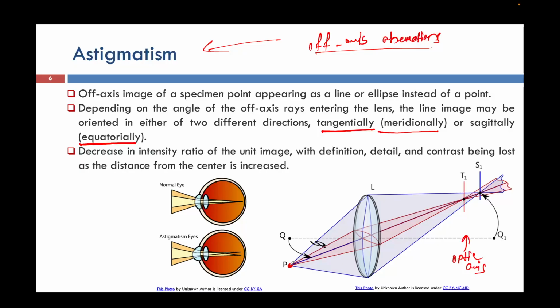Let's say you always cannot have a point. We are living in a three-dimensional world. So let's say if you want to put a circle or any kind of three-dimensional, let's say a cylindrical cast iron, you want to see its structural features, then what you will do? That cylindrical iron, the line which passes through the center of that cylindrical iron, only that can be put here. Okay, and let's say I am putting, if I draw like this, let's say my sample is like this. For now, consider my sample is like this.